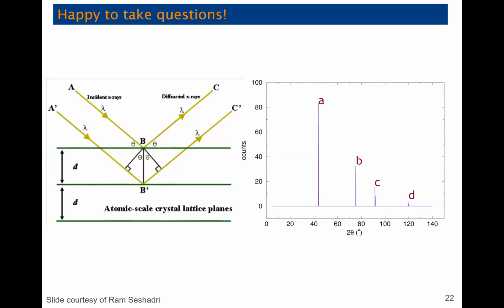You can sometimes correlate that with a certain voltage plateau that you see in the discharge. So it's a really great way to start to learn about solid solution behavior or actual phase transitions and how your battery is actually getting its capacity out. It's very cool.